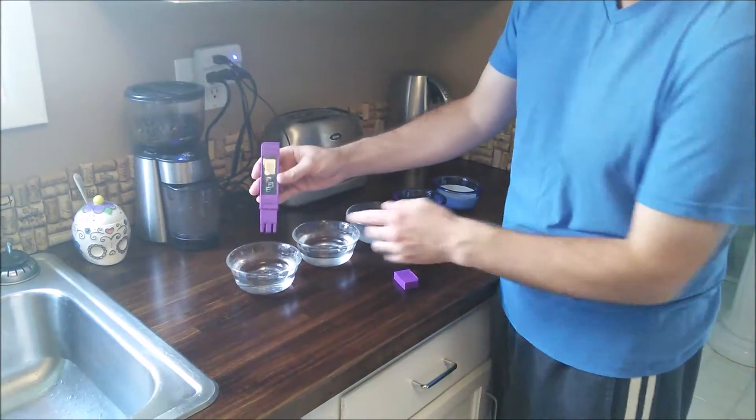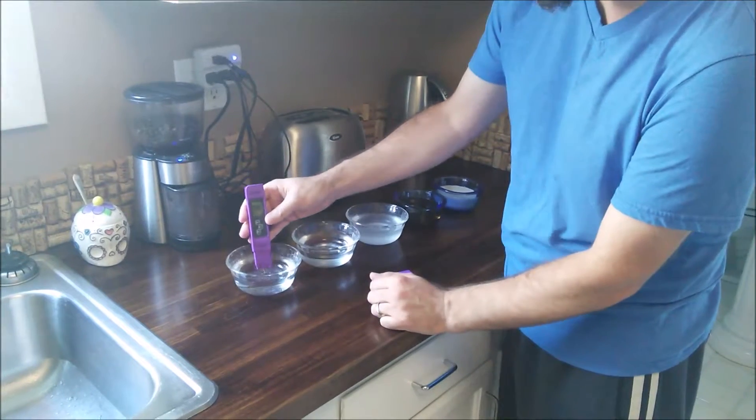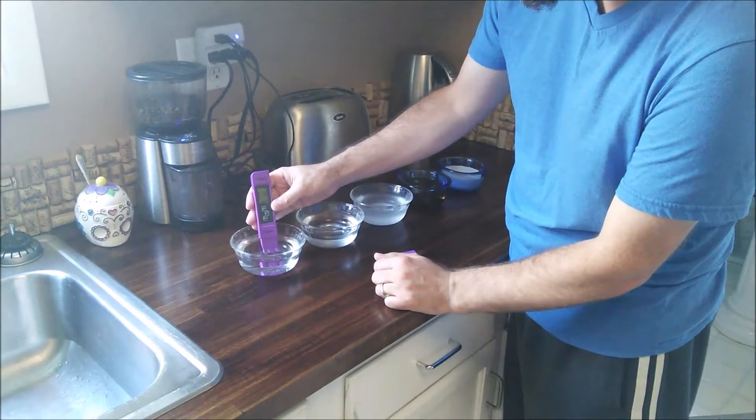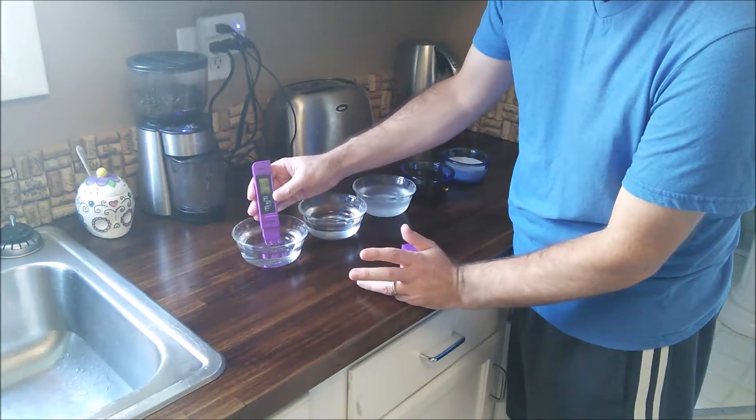I have some regular tap water and this is completely unfiltered. That comes in at 136 parts per million.